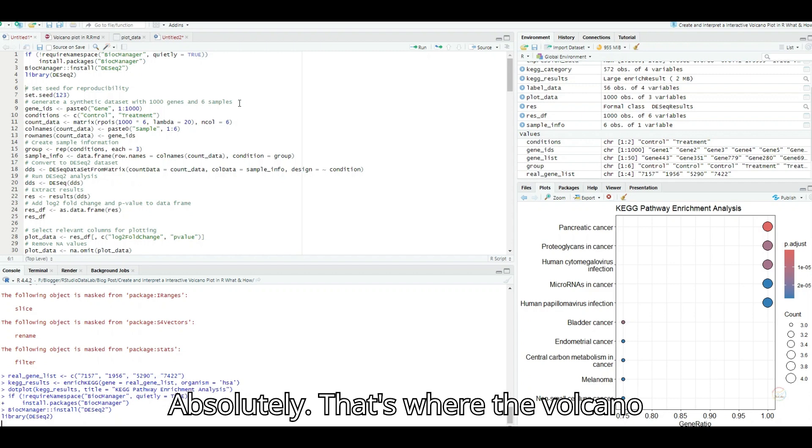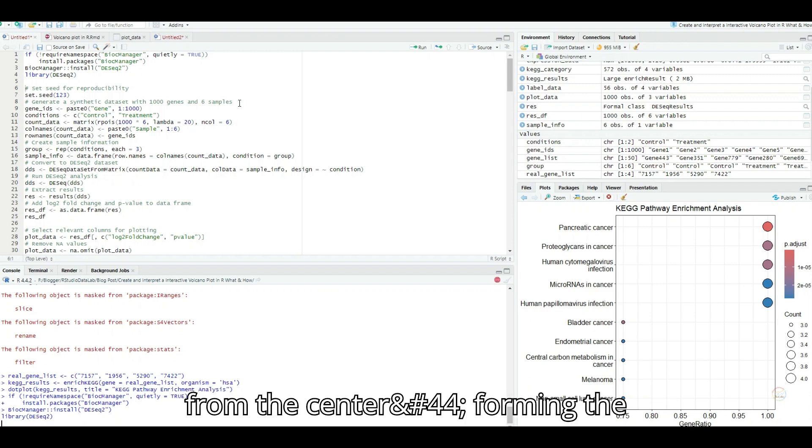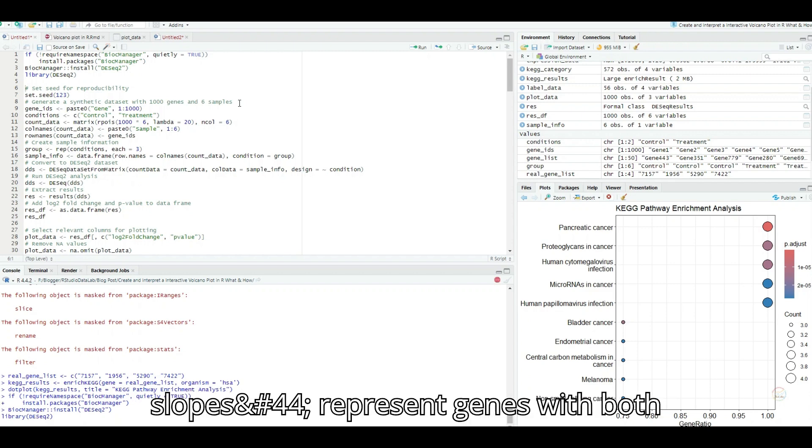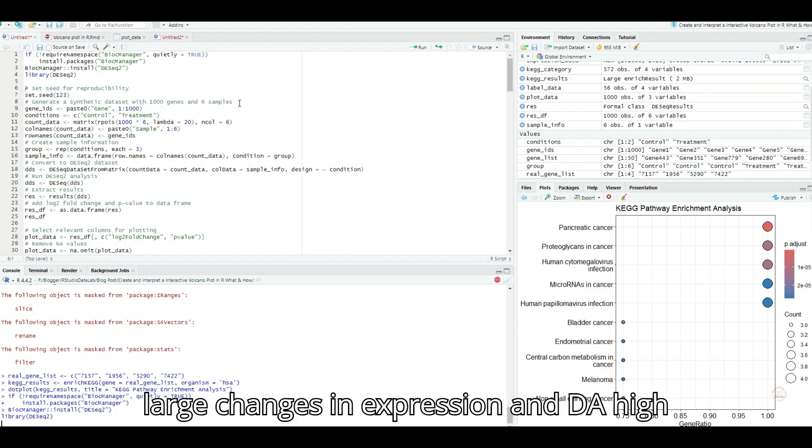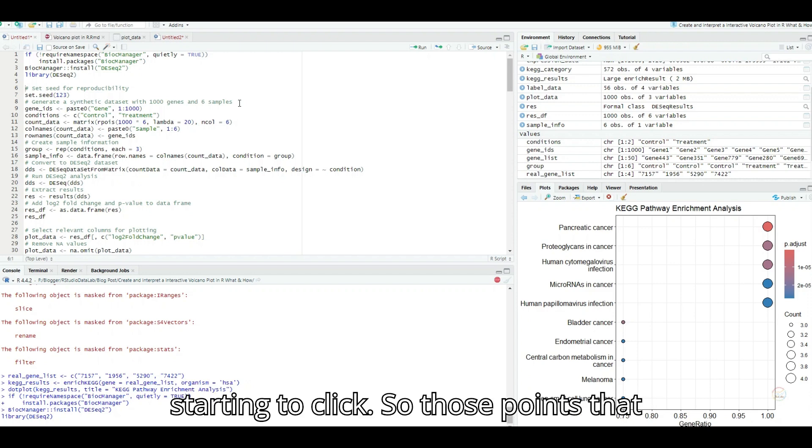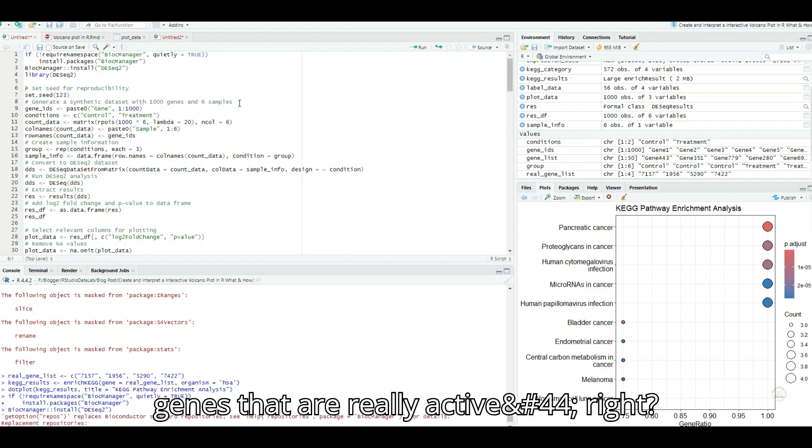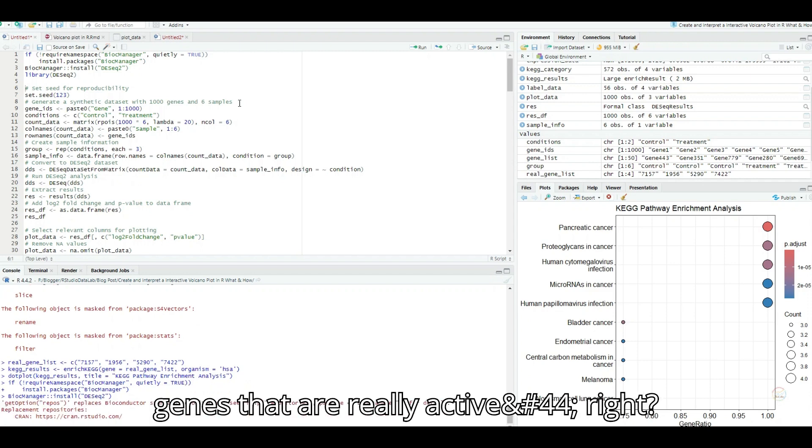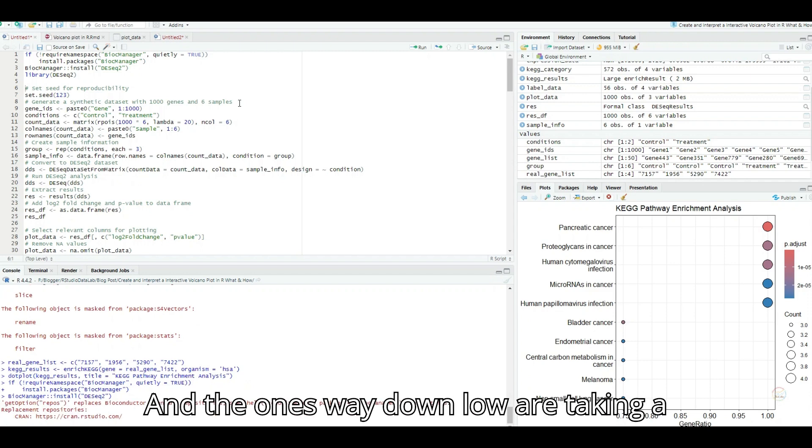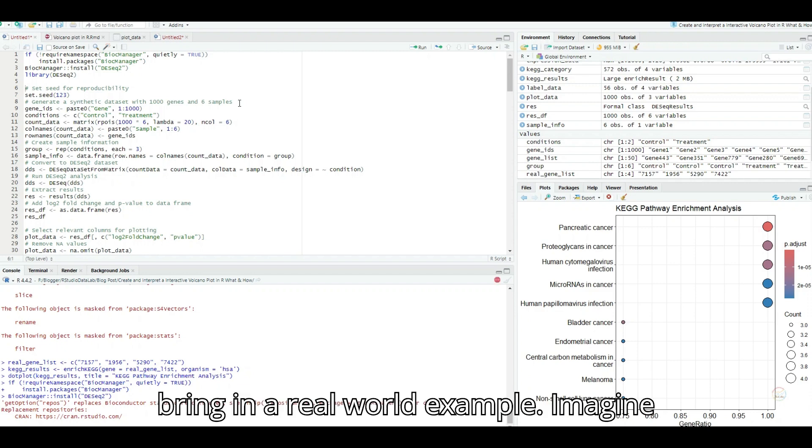Absolutely. That's where the volcano shape comes in. Those points that are far from the center, forming the slopes, represent genes with both large changes in expression and high statistical significance. This is starting to click. So those points that are erupting upwards like lava are the genes that are really active, and the ones way down low are taking a nap. A great way to visualize it.